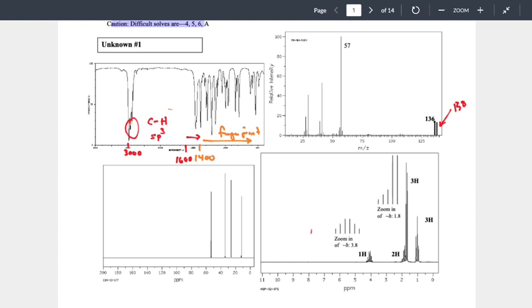No, it's 3. I just thought of the 3rd. There's 3 possible ways you could do it. Okay? So you could immediately try and draw formulas or structures. I don't recommend that because in this particular case, 2/3 of your work is wrong. So let's see if something else gives us more feedback to help narrow the field so that we aren't guessing at too many different things.